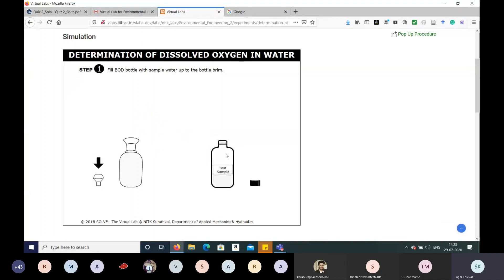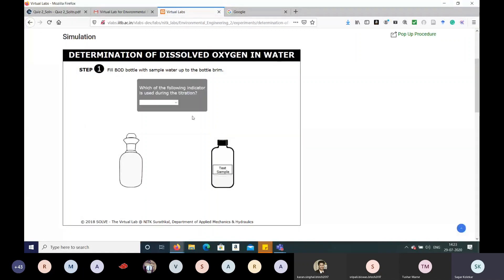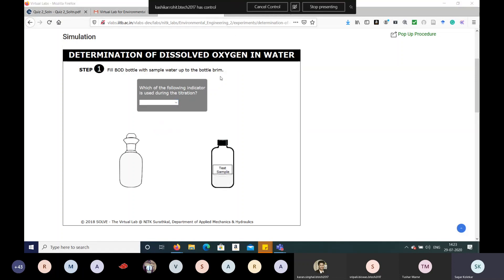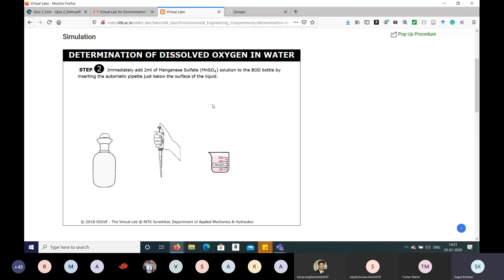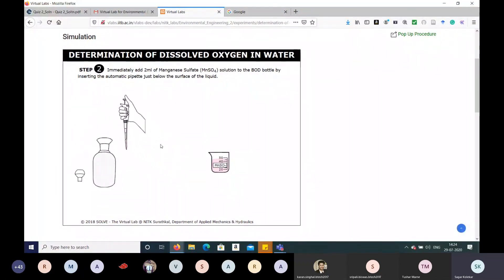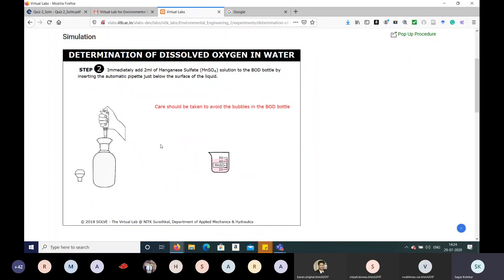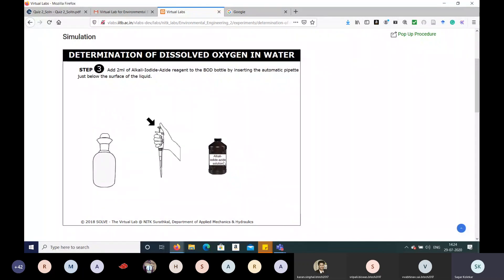This virtual lab will give you an idea of what chemicals to use and the procedure to follow — you will also prepare a video of other experiments as an assignment. The indicator used during the titration is starch — that is the correct answer. Step two: immediately add 2 mL of manganese sulfate (MnSO₄) solution to the BOD bottle using an automatic pipette, taking care to avoid bubbles.